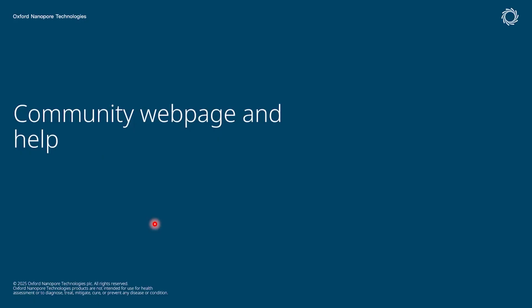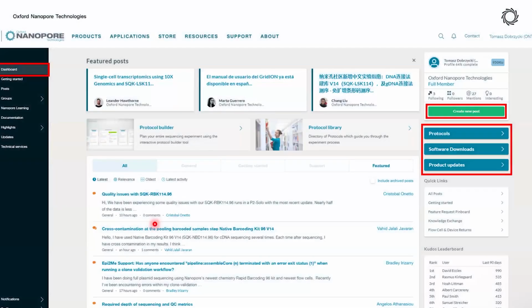After that, we can take a look at the data which got generated, and see if we can help you start a run, either with Epi2me if it is installed yet, or any help you need regarding installation, we can try to do that after this.